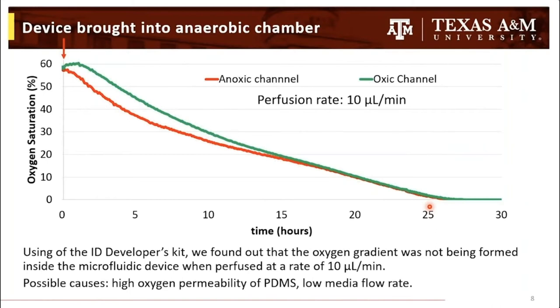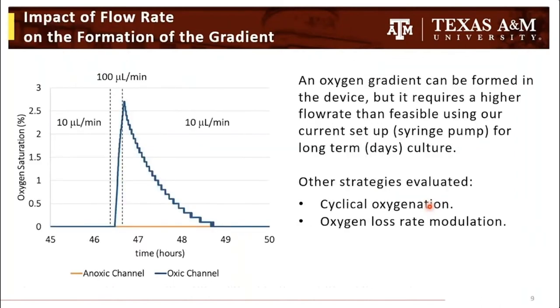But we did confirm that we could generate this oxygen gradient if we increased the flow rate of water.